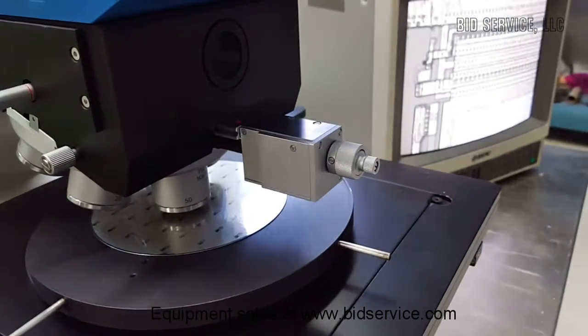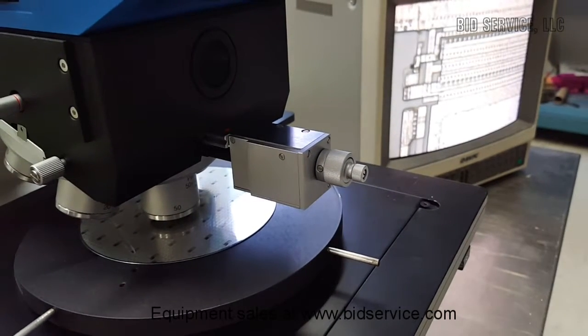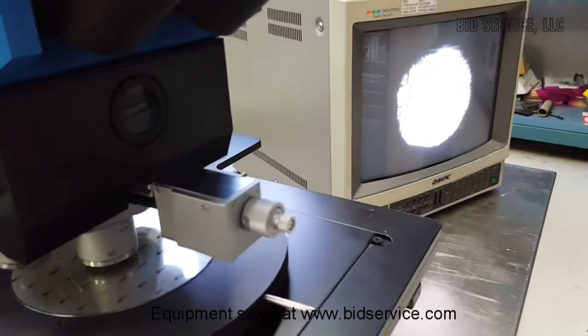That one is actually the f-stop. There we go — there's the field.